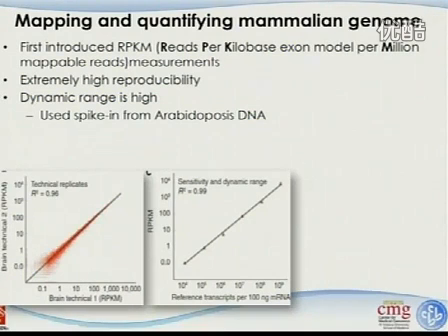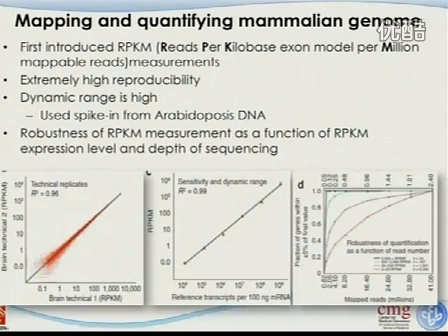Based on this, it's equivalent to 10 power 5 transcripts in 100 nanogram of messenger RNA sample, which is very important information.